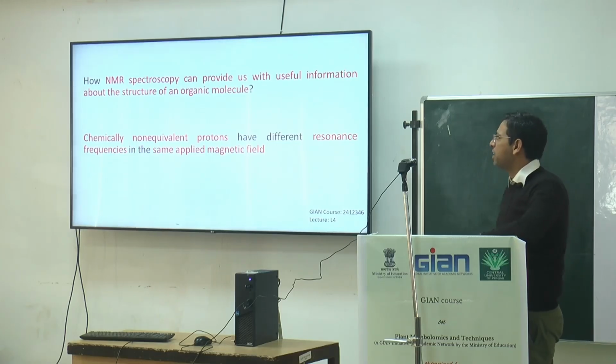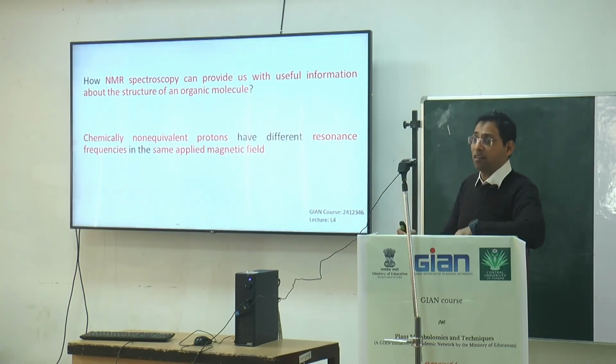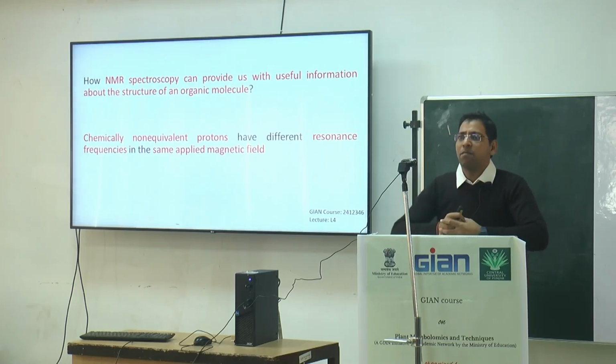So this is a question that I would like to ask myself, not you: how is this spectroscopy useful for the structure of organic molecules? I am taking organic molecules as an example and trying to understand how it gives the structure of that particular organic compound. Basically, chemically non-equivalent protons have different resonance frequencies in the same applied field.